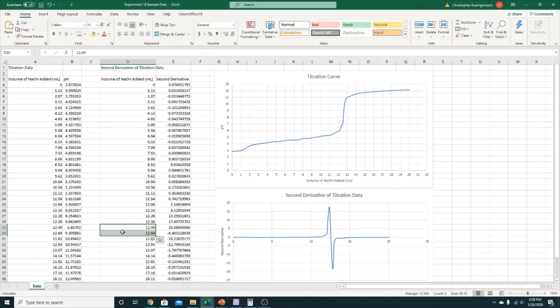And then we're going to do the same process. To get the pKa, we're going to figure out what's half of that volume. So in this case, it's going to be about 6.5, 6.75, whatever. You divide the equivalence point volume by 2, whatever you get. Now, again, that's not going to be one of these precise numbers. It's going to be in between one of these numbers.